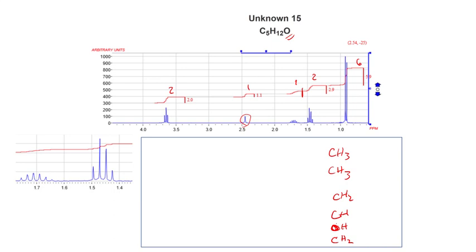All right, so we'll take our 2 CH3s here. And we know they're next to 1. Well, we've got 1 CH. So we're going to connect each of those to the CH like that. Notice I'm not redrawing these at all. I don't need to do that. I'm just making this crazy picture with the curved bonds. And then we're going to write it out later. Okay, what do we know about that CH? Well, that would be this one, wouldn't it? And the splitting there is consistent with the fact that we have multiple hydrogens next door to it. So that's good.